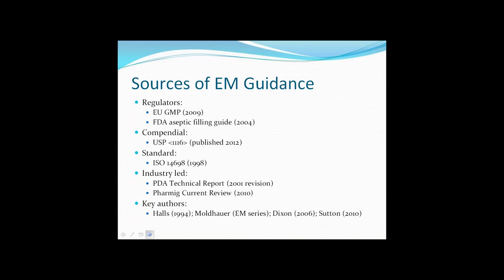However, despite all that advice, it remains that the environmental monitoring program is an area which the site microbiologist must develop. And there are a lot of key questions which need to be grappled with and eventually put into some form of policy or rationale. And this includes such areas as which type of media to use, how long to incubate for, how frequently to monitor, sampling methods, when to take the samples, sample locations, and things such as data analysis.